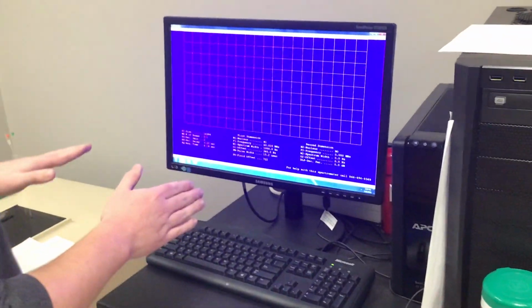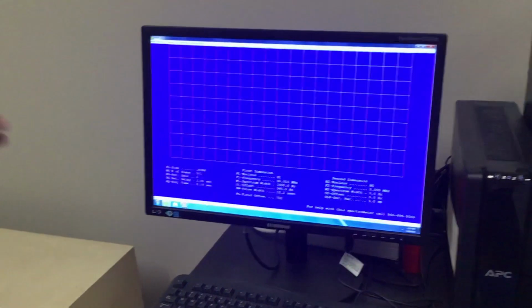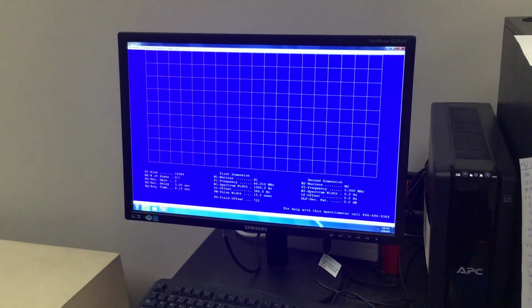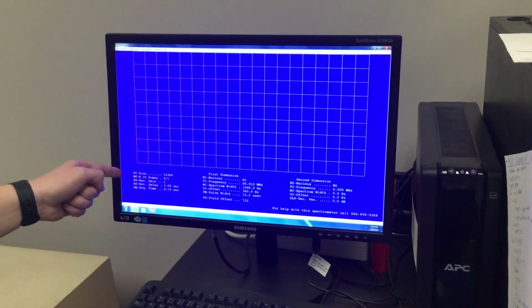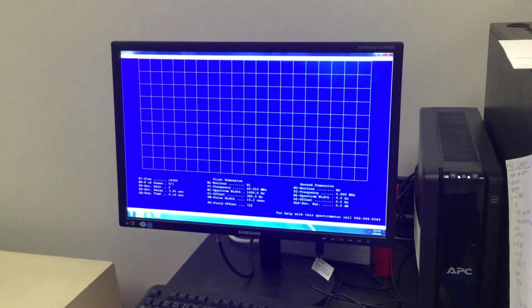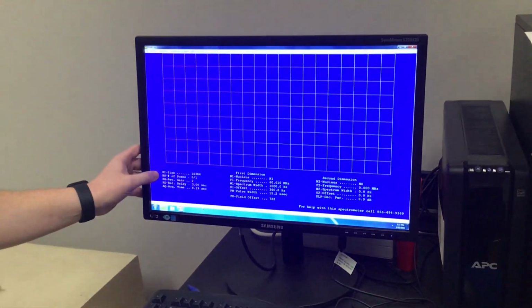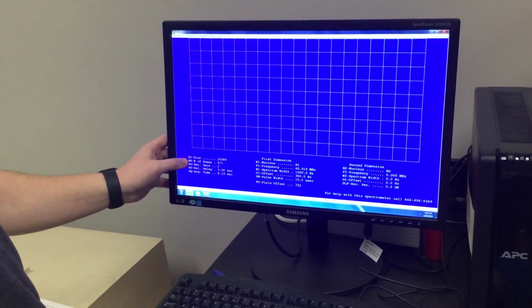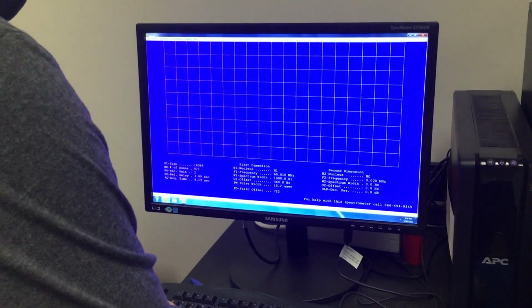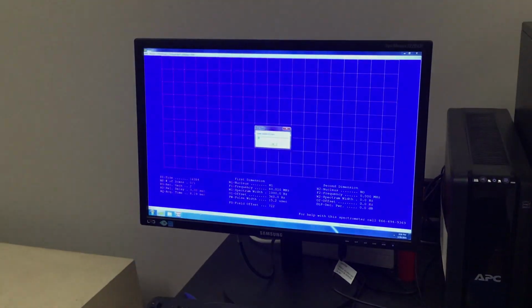So, once this is all done, it's ready to go. The relaxation delay is all fixed. Now, the next thing you're going to need to do is tell it how many times it needs to run the sample, how many times it needs to take that NMR. You can do this by changing the number of scans over here. Currently, it's set to 1. That's not very good. You need to have more than that to actually get a strong reading off of this stuff. So this right here is the letter code that you plug in to pull up the screen to calibrate it. Number of scans is NS, so I hit NS and enter, and it pops up asking how many scans you want it to run.